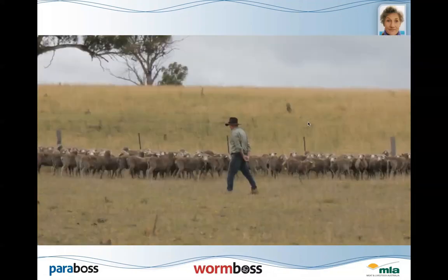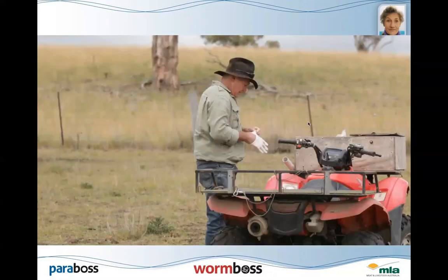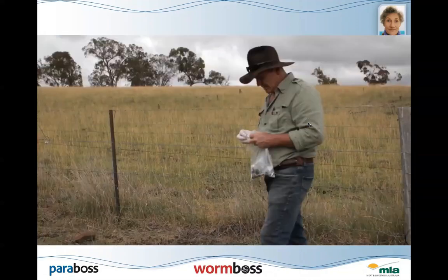Just put them along a fence line and hold them there for a few minutes, and while you're doing that, they'll pass some dung. After a few minutes, go and get your gear, get your gloves, get your bottles, and by the time you wander back, the sheep will hopefully have wandered off at a walk, because you don't want them kicking that dung around.